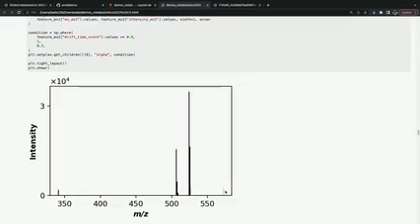You can see that this fragment here at about 575 m/z scores below that threshold, but the rest of the fragments here are very highly associated with this precursor based on our deconvolution algorithm.